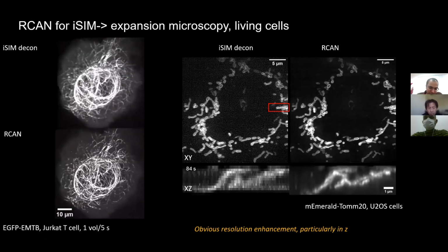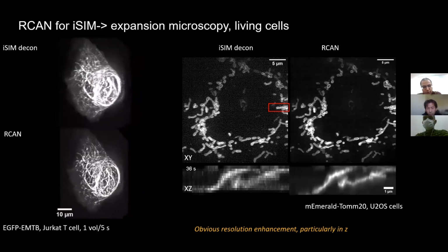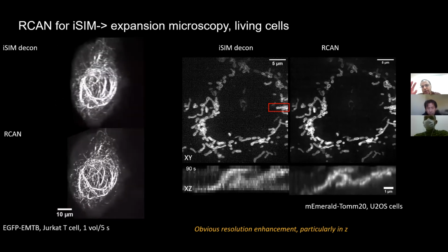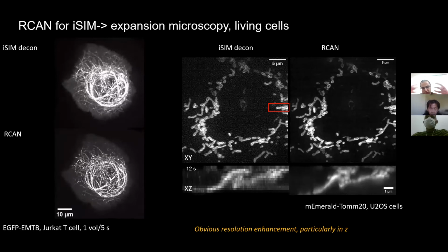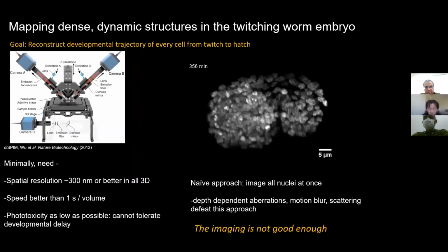So, I've given you some examples where I hope you can see how these tools might be useful, right? If you can build up training data on commercial systems. I now want to talk a bit about using this in conjunction with a non-commercial system, a very new system we've just built. But the motivation biologically is the following.